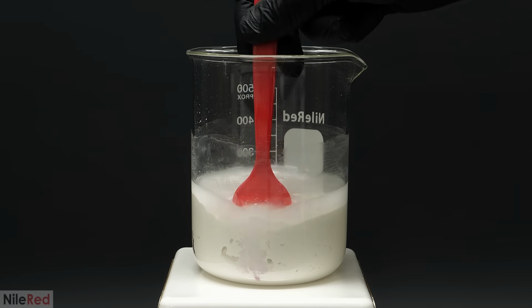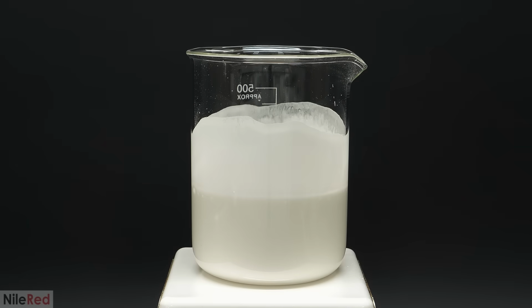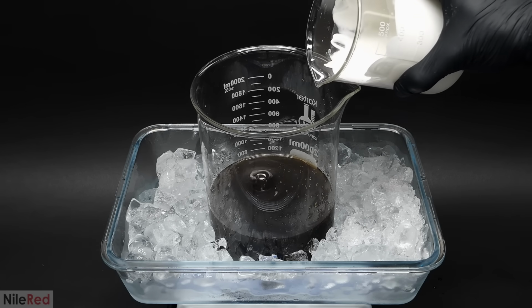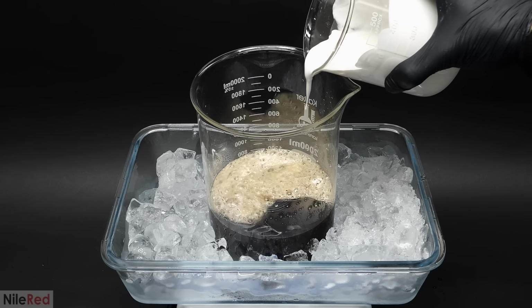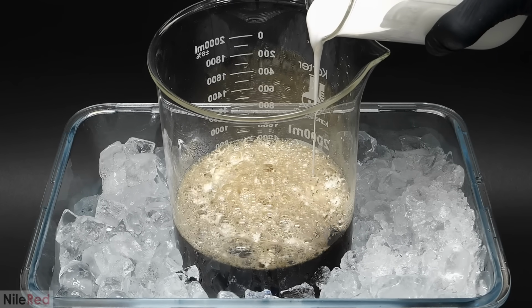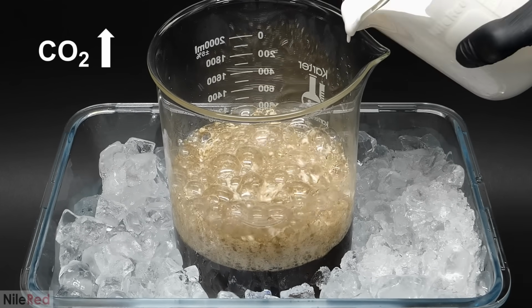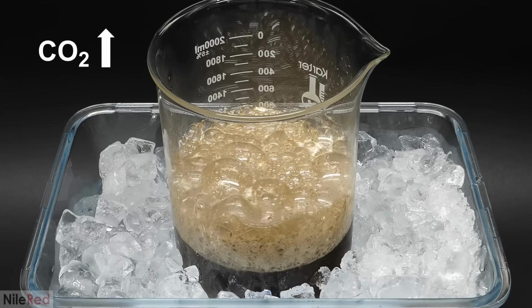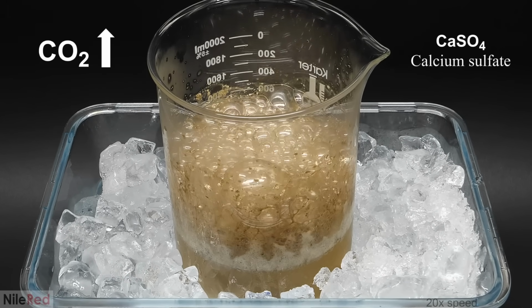I then stirred it around, and after a few minutes, it was good to go. When everything eventually cooled down to around room temperature, I started adding the goopy chalk. It reacted almost immediately with the sulfuric acid, and it was releasing a lot of CO2 gas. This was all being generated as the acid was being neutralized, and the acid itself was turning into calcium sulfate.